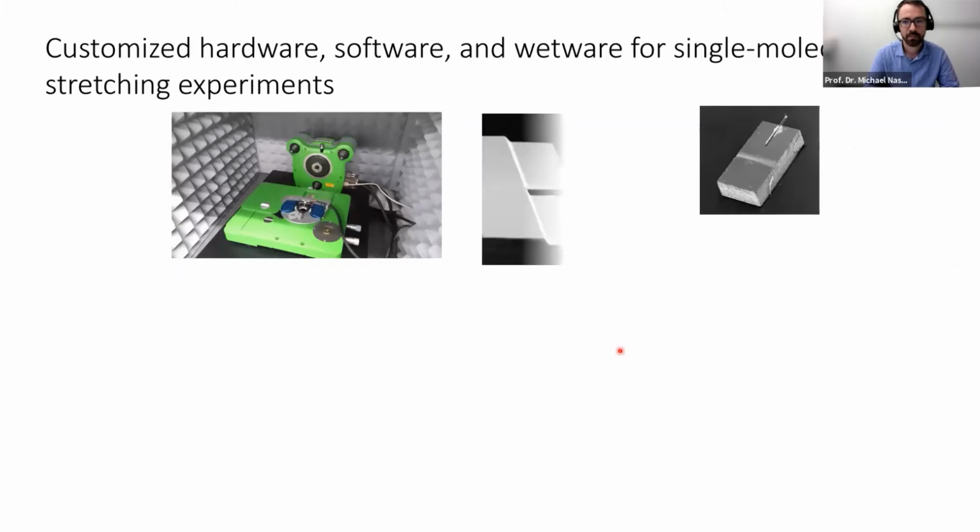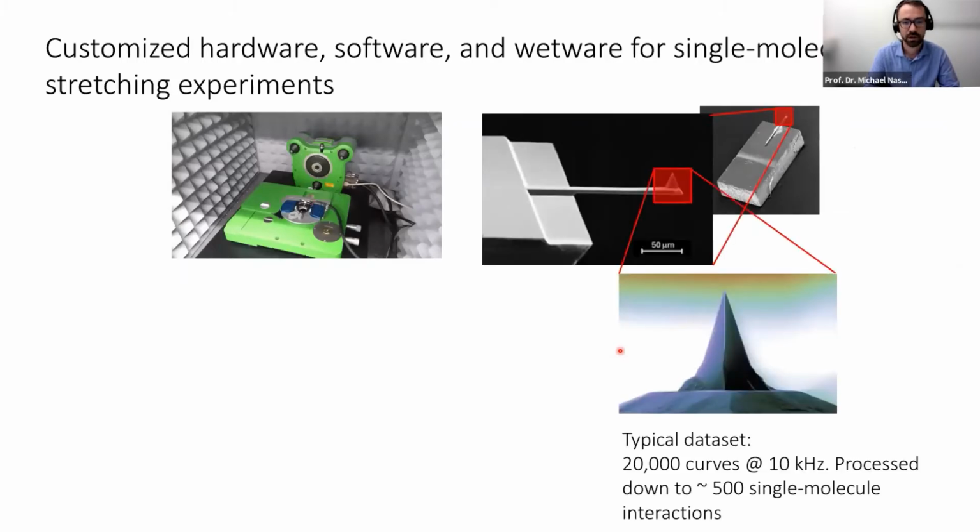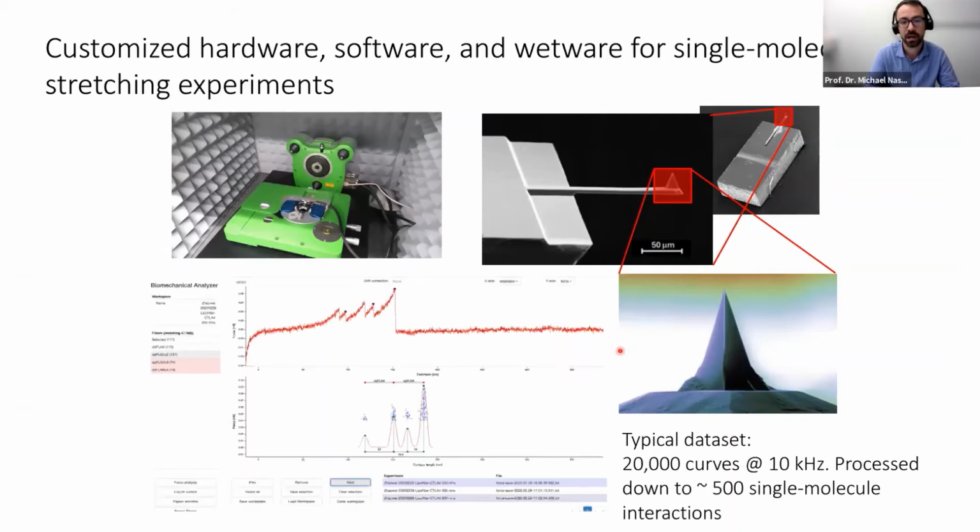So my lab is using the best current methodology for AFM, and this has been contributed to also by various people and groups, so I don't claim ownership over any of these methods exclusively. We're also happy to share methods and especially plasmids with the community as well. But the way we do this now is with a force robot system from JPK, and then we have, of course, cantilever tips, which everybody in this audience is already familiar with, and then we have back-end processing software to analyze curves.